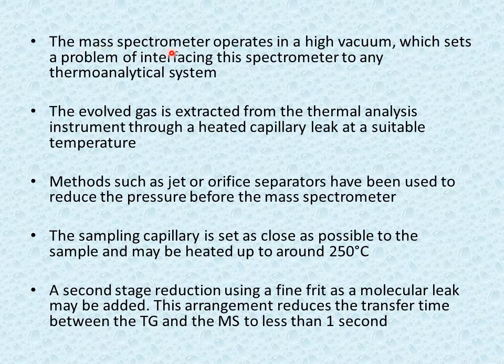The mass spectrometer operates in a high vacuum, as we have seen earlier, which sets a problem of interfacing the spectrometer to any thermoanalytical system. Because the mass spectrometer operates under a reduced pressure, it is quite difficult to put this spectrometer in contact with a thermoanalytical system.